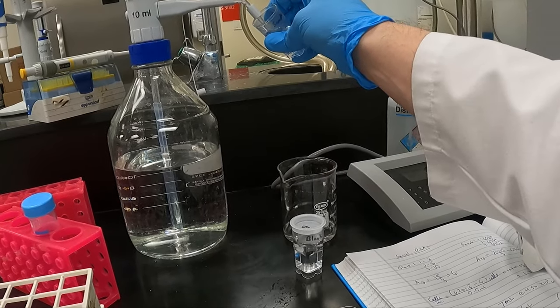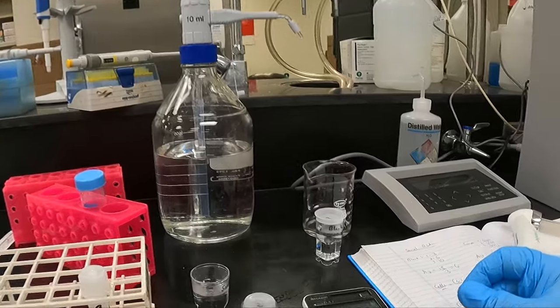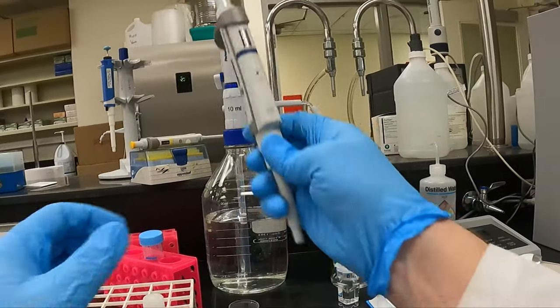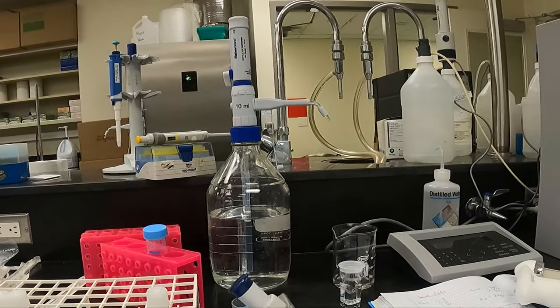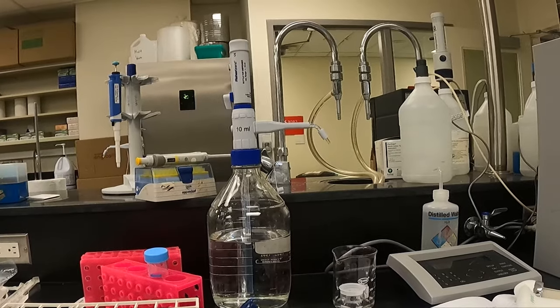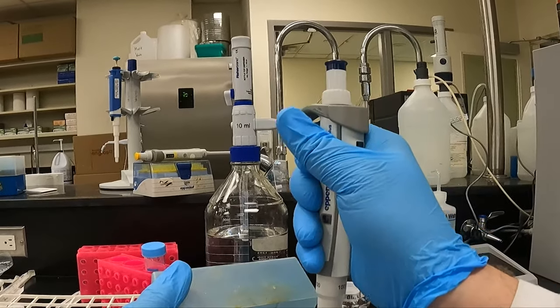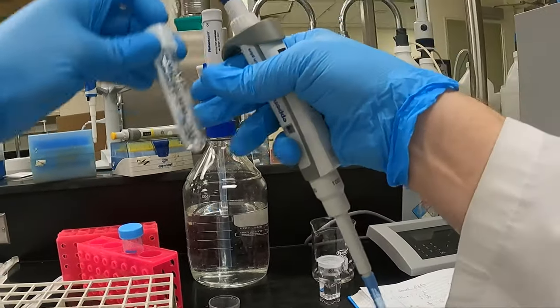Now, because this is a very dilute solution, this is actually a very challenging dilution. I will not ask you on the lab practical to go below 10 to the 4. This is below 10 to the 4. So to improve upon my counts, I'm going to load in not 0.2 mils, but 1 mil of cells. So we're loading 1 mil of cells into 20 mils of isoflow. That's 1 over 21 is our dilution. So our dilution factor in this case will be 21 over 1.